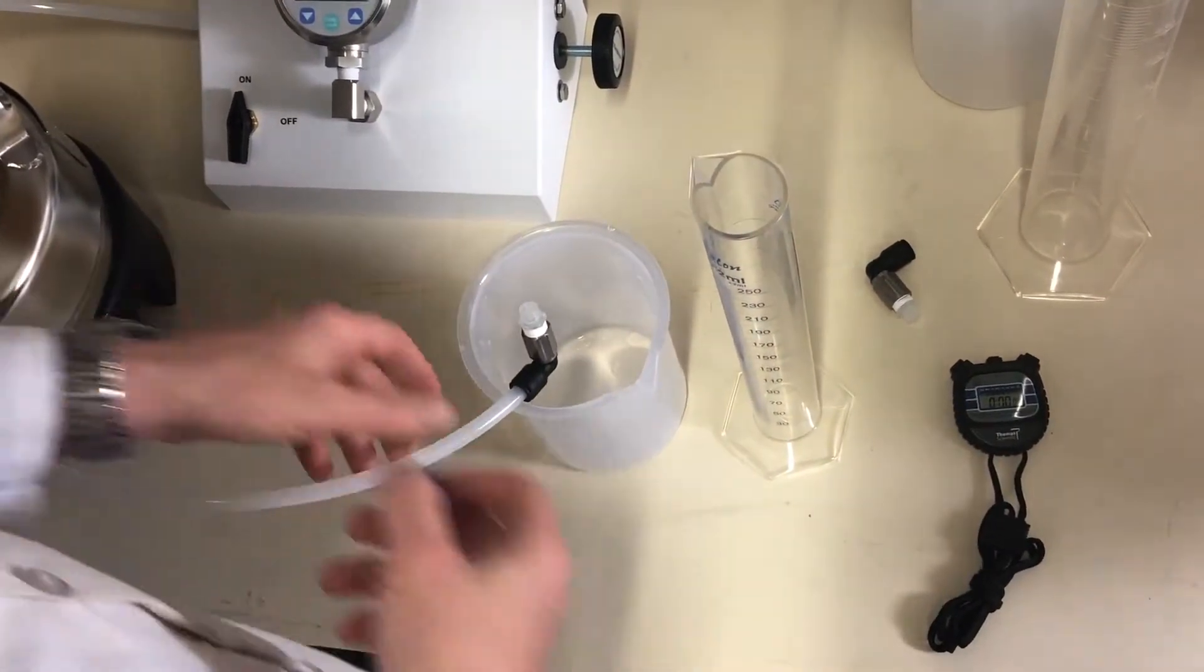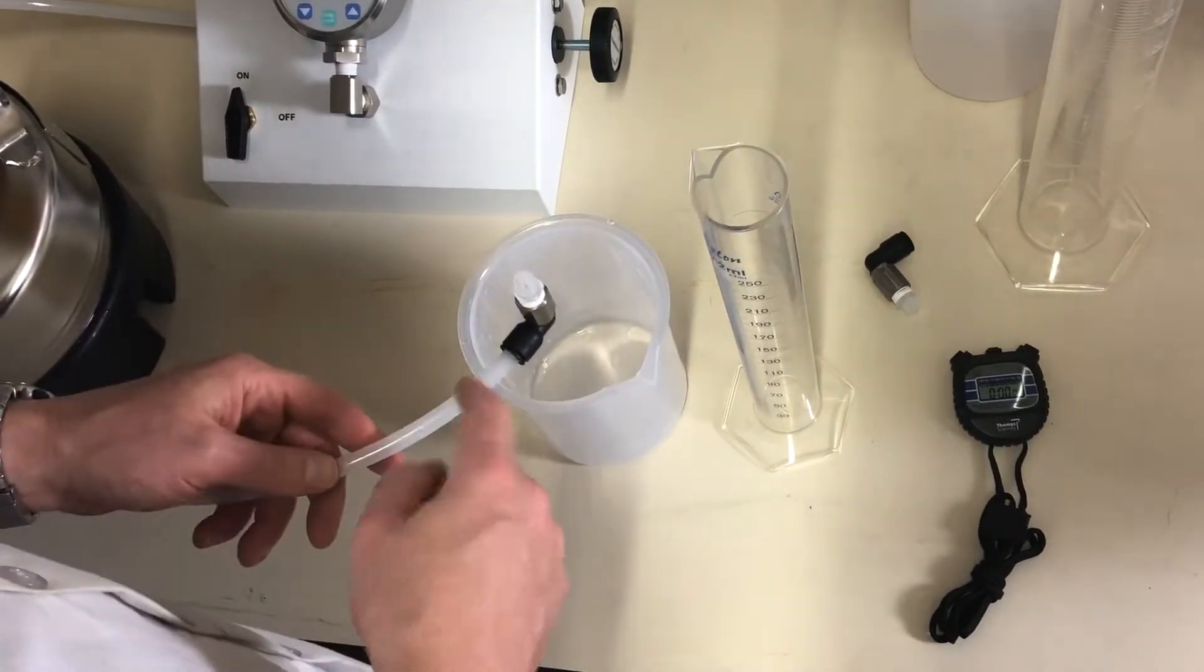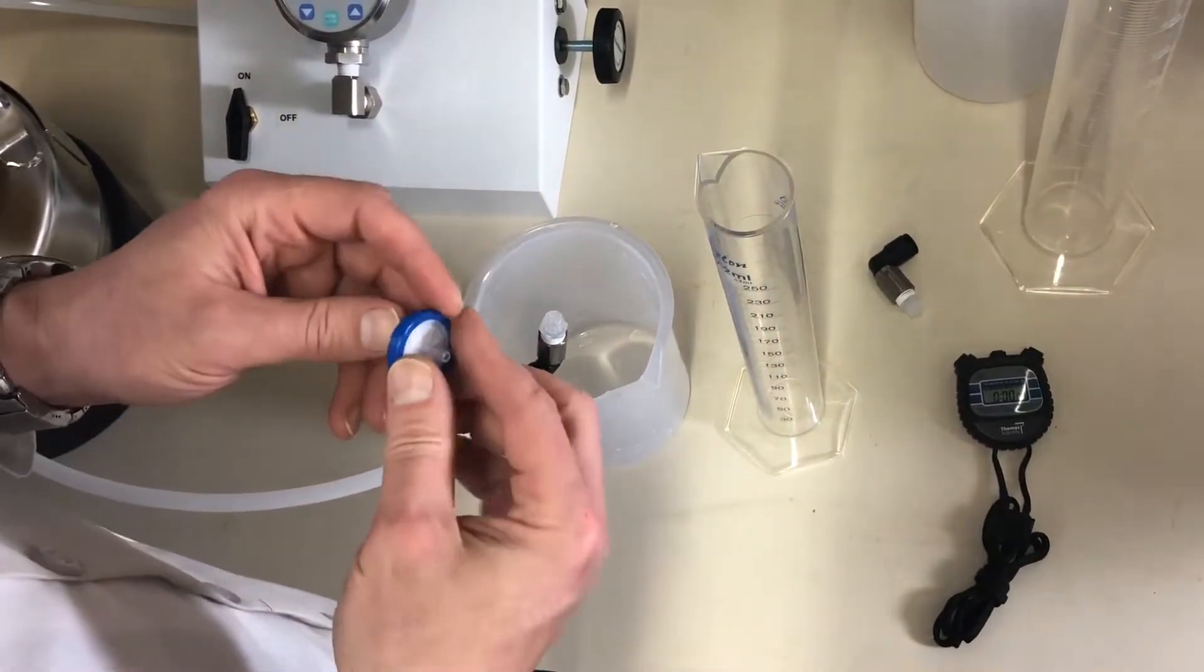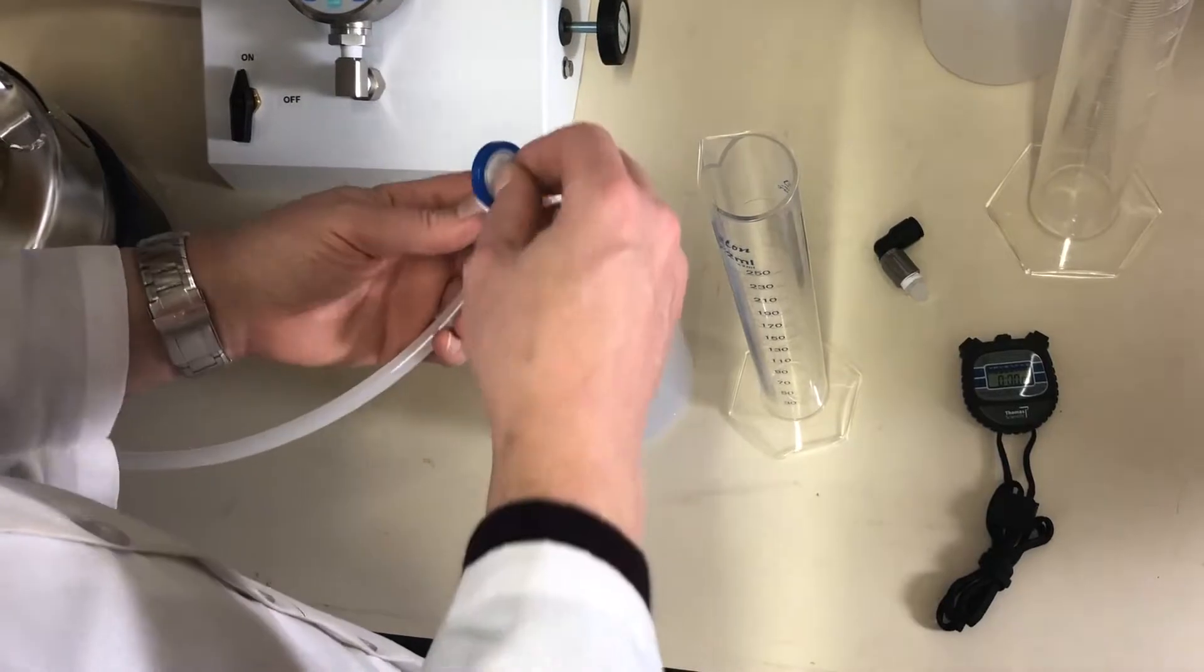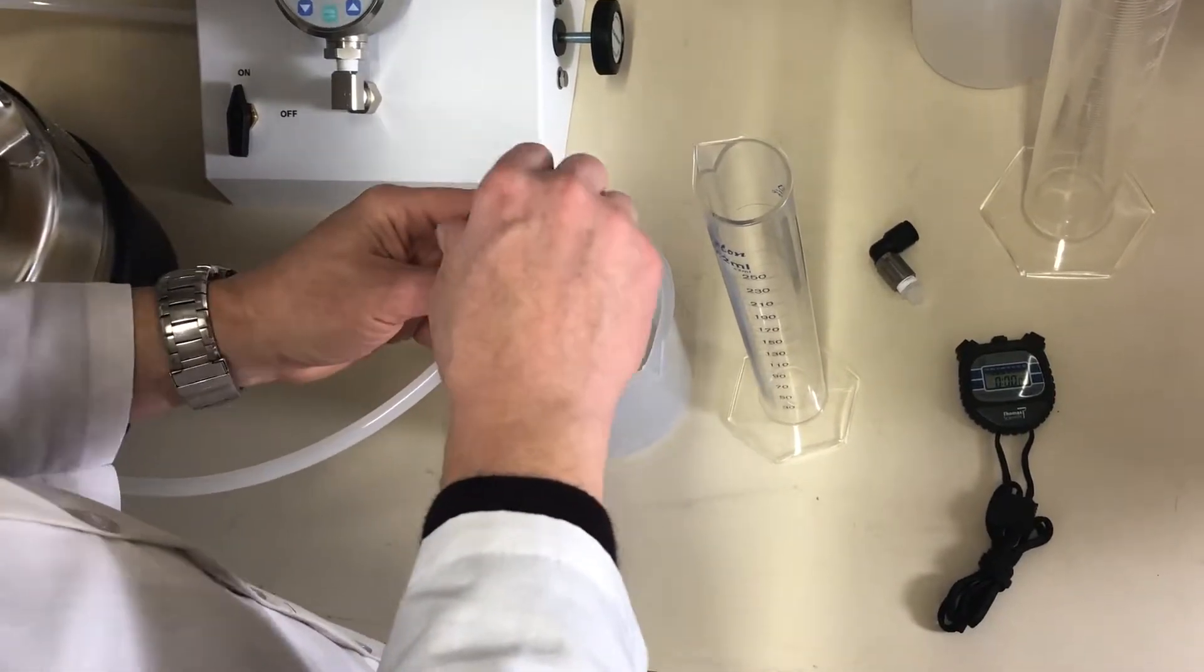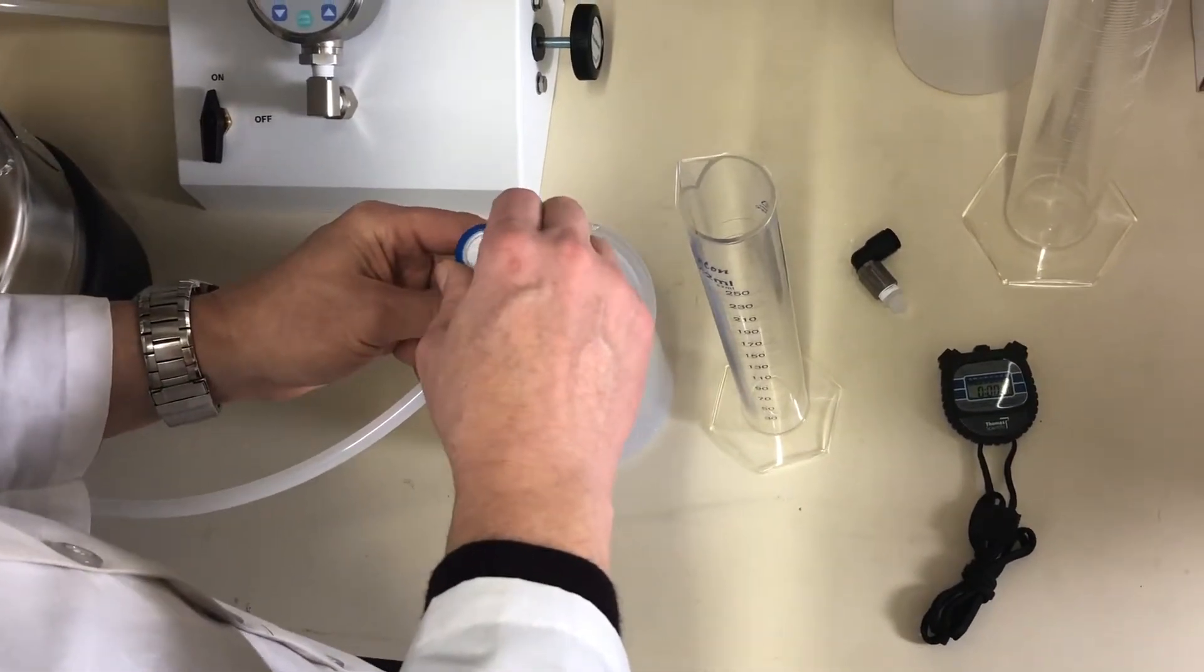We turn the fitting so that it's facing upward on the outlet tubing. Attach the test filter by installing and twisting until it's tight.